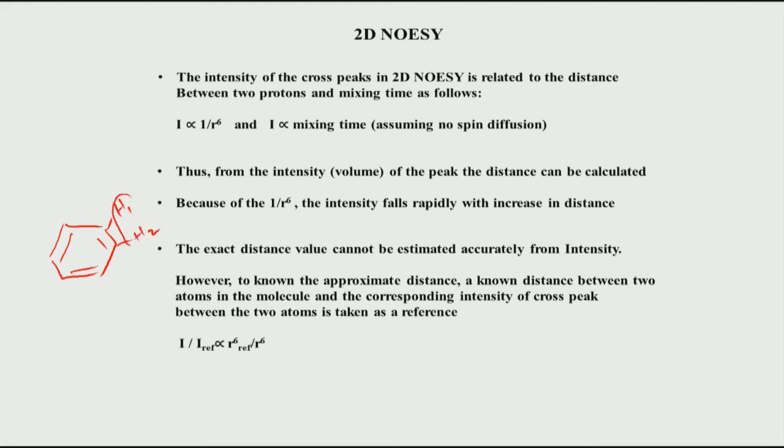Typically, this distance is fixed. Why is it fixed? Because according to chemistry, this is a planar structure with sp2 hybridized carbon, and this angle cannot keep fluctuating. If the angle cannot fluctuate, that means it is a fixed angle. So, obviously, these two are at a fixed distance from each other.